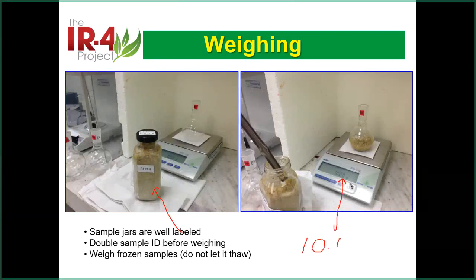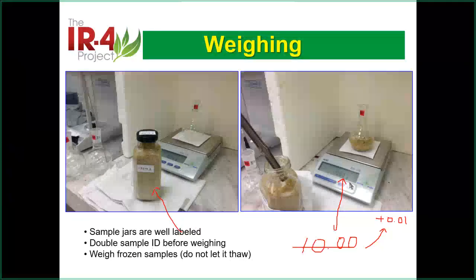That's exactly. You do not have to weigh exactly. But this number, if you wait there for like 1 or 2 or 3 minutes, because of the humidity, you will add another 0.01 or 0.02 there. This is likely to happen, and this is okay because it depends on where you are. If your working condition is very humid, you will see big change.